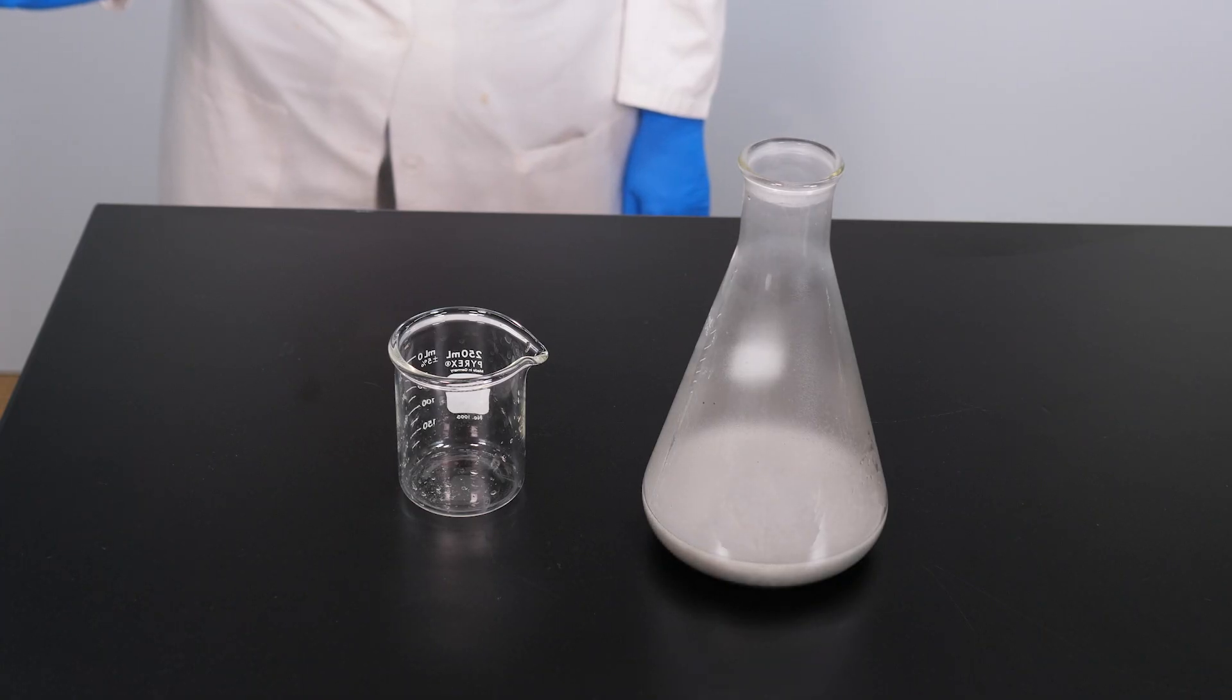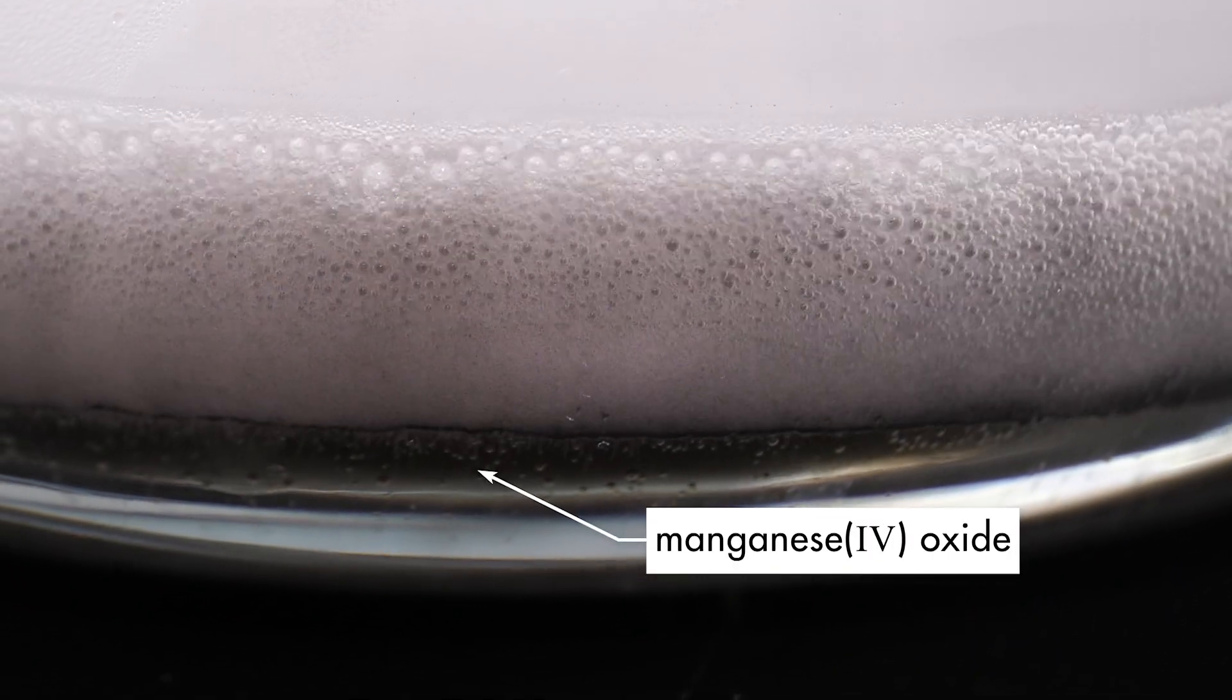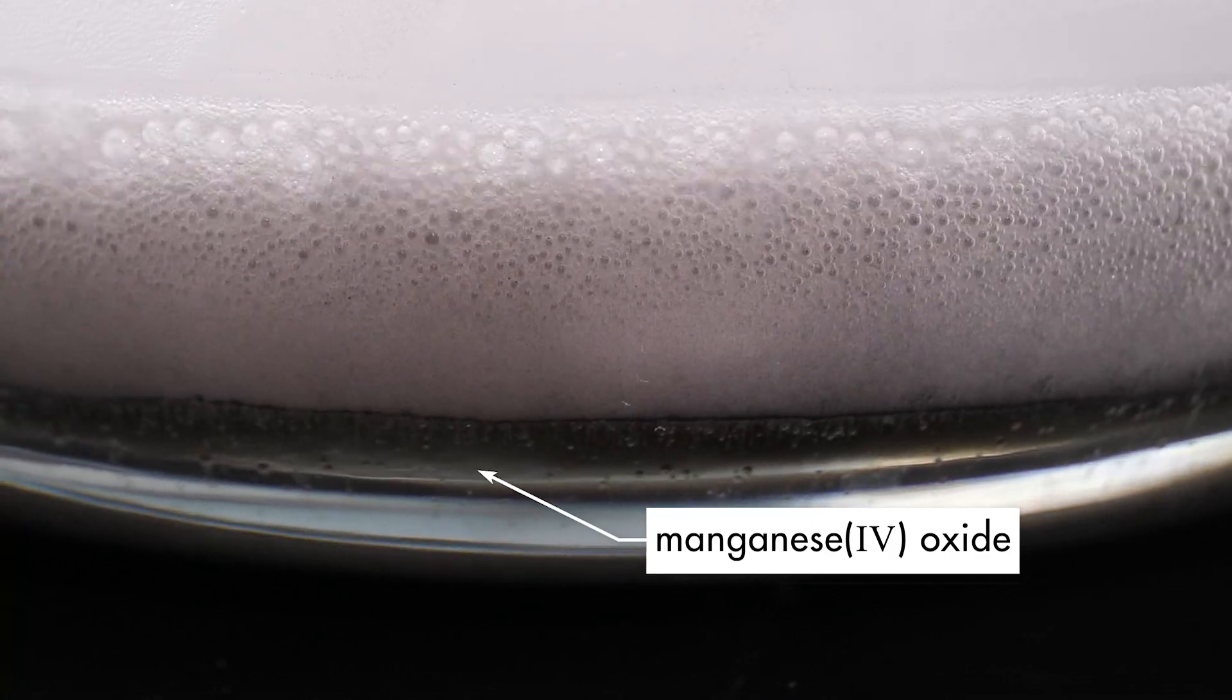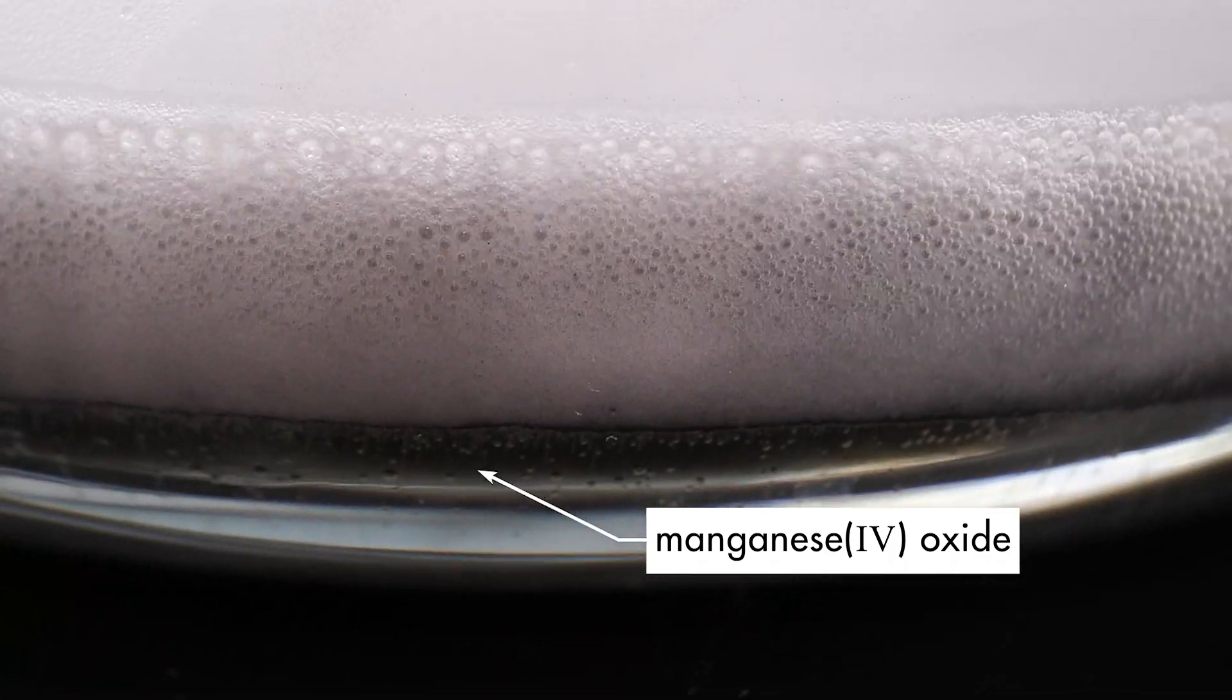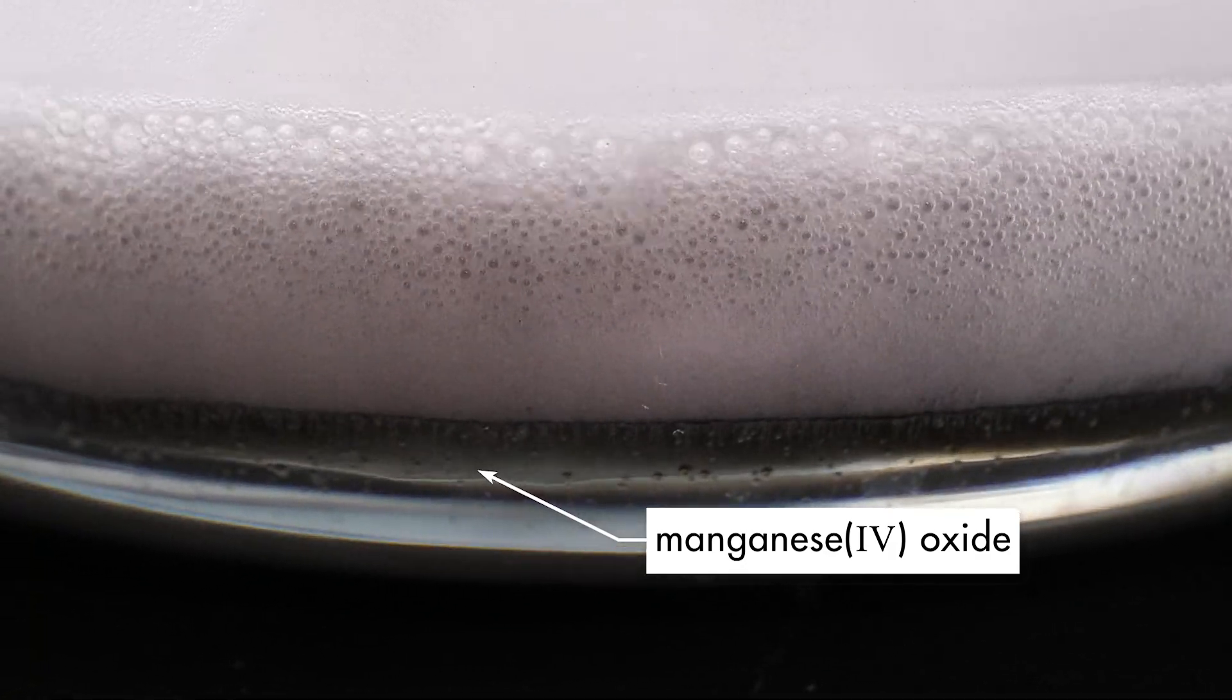After the reaction has ceased and the flask has cooled, we can see that the manganese(IV) oxide is still present. The catalyst caused the reaction to speed up, but it has not been altered by the reaction.